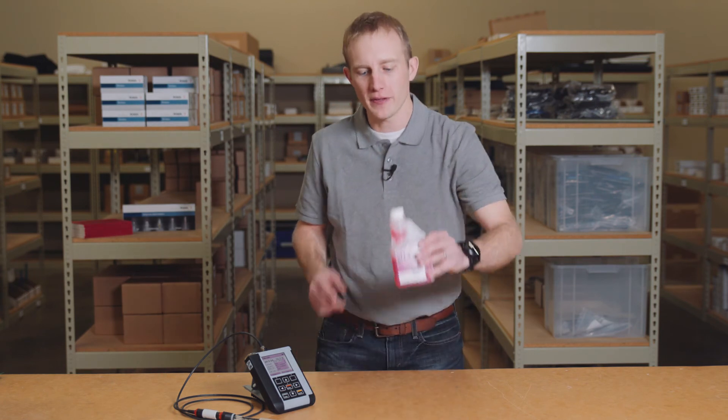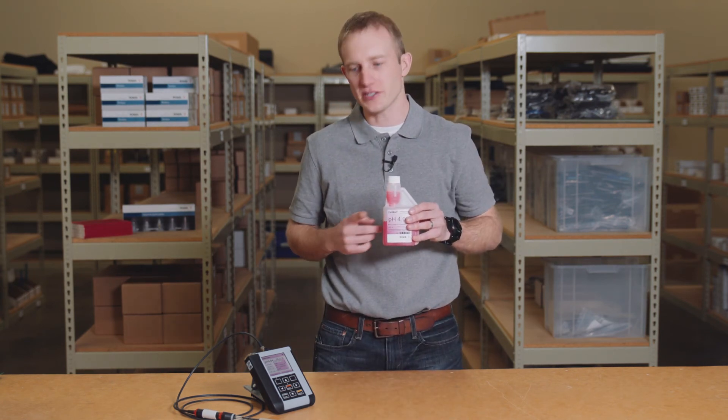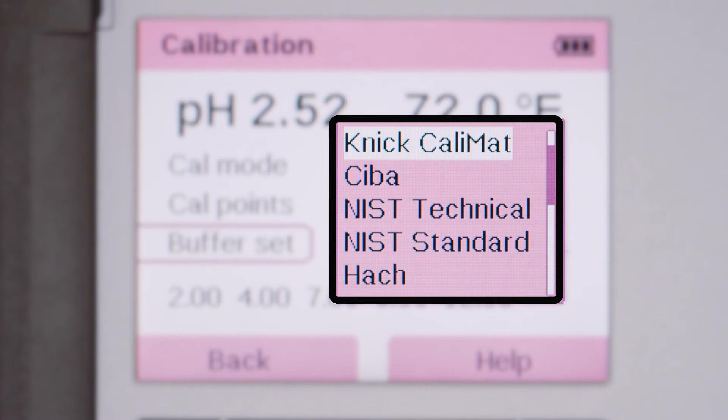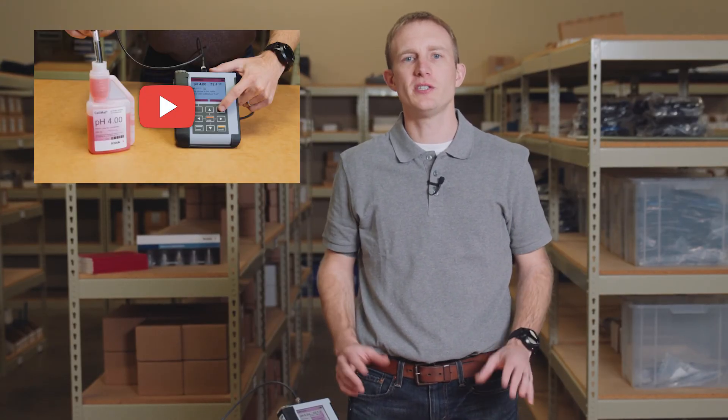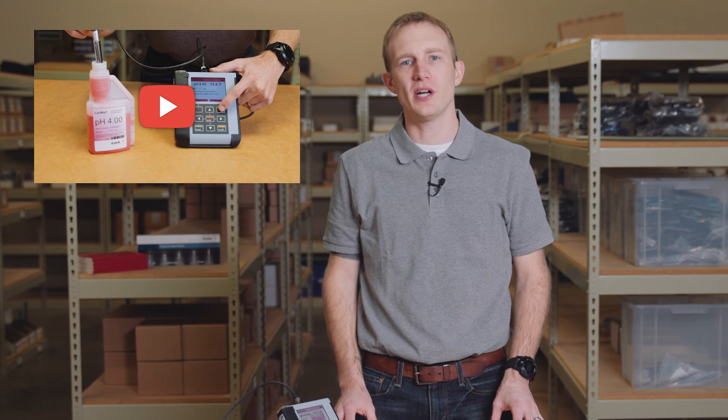When troubleshooting a sensor that is not accepting or failing calibration, it's very important to check that the calibration settings in your Portavo are set up properly. Calmatic set up with the wrong buffer set selected is a common cause for failed calibrations. Verify that the buffer set you are using matches the buffer set in the selected menu. If you are unfamiliar with setting up your Portavo's menus, please be sure to check out our Portavo calibration video.